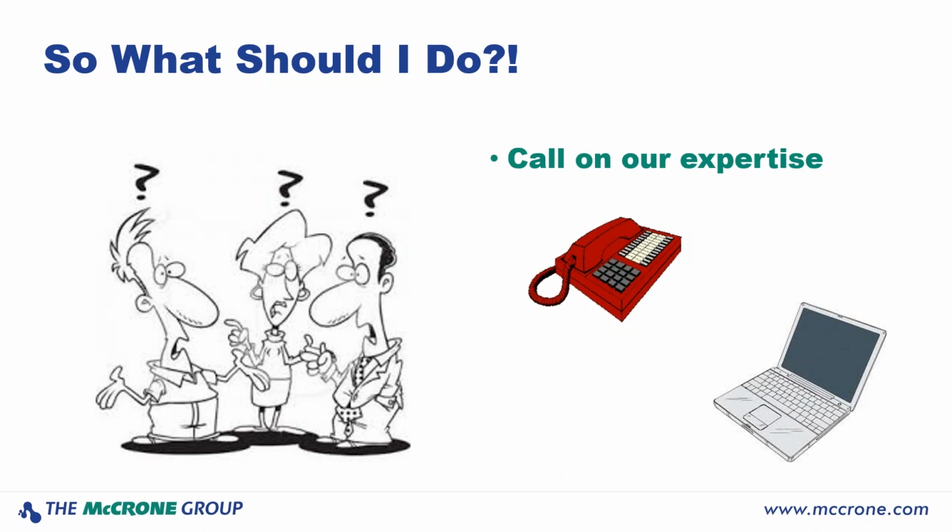And we'll be more than happy to work with you to give you the best, most useful results possible, taking into account your matrix. This is also the time to talk to your chemist, talk to your project leader, and find out which samples they may need as a matrix comparison, because as we pointed out with the swabs, sometimes that might be something you're not automatically thinking of.